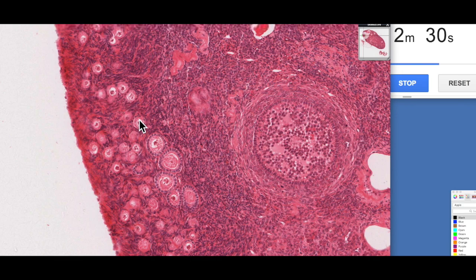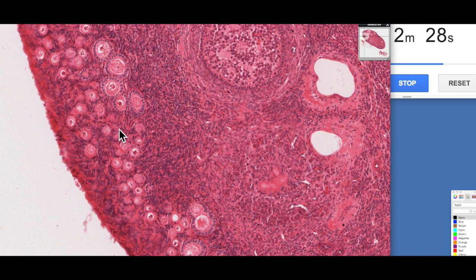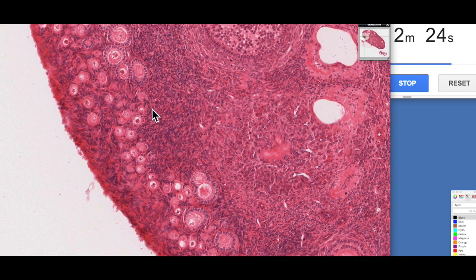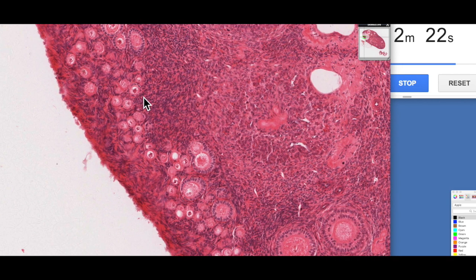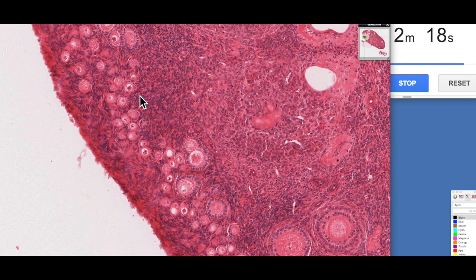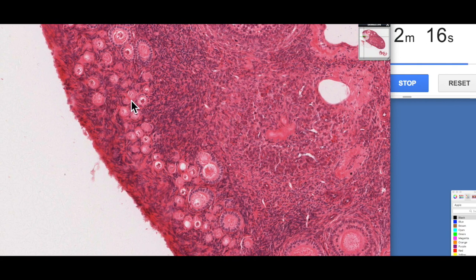These are the store of follicles, which some are stimulated to grow each month and become primary follicles. So primordial follicles are classically identified as having these small round cytoplasms. You can see the nucleus here. So we'll zoom in a little bit.